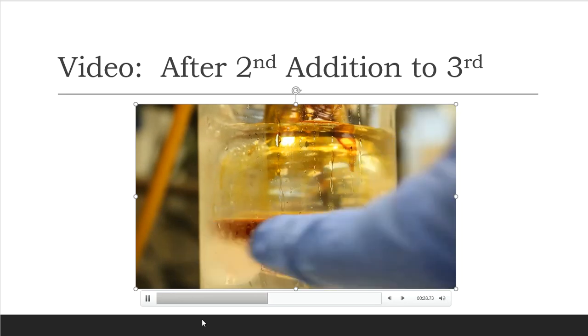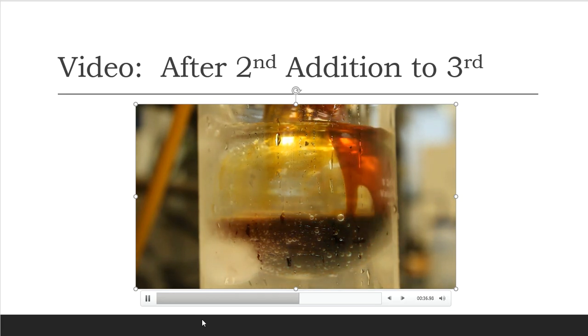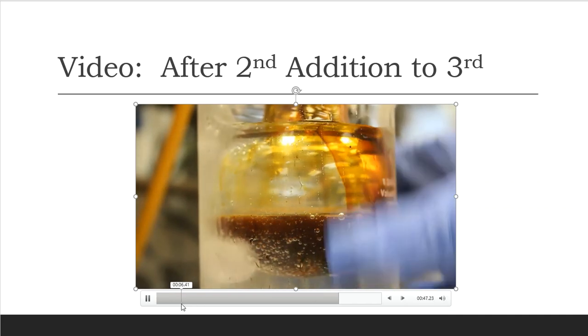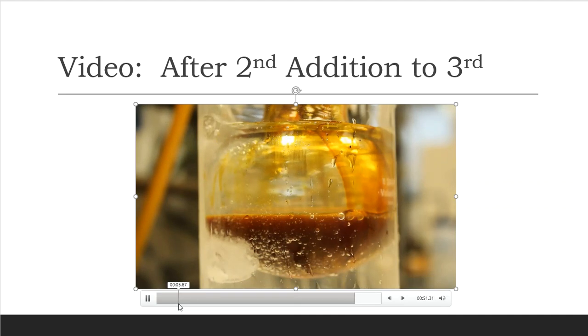So I wanted you to see the original color before I add in the next portion. And now I'm going to add in a little bit more THF with the iodine. You can see how much I've added. It did get a little darker, but nowhere close was it the tangy, orangey color that it really does like to have before these additions go. So it's not a problem, but once again, I just wanted you to see this addition as it takes place.